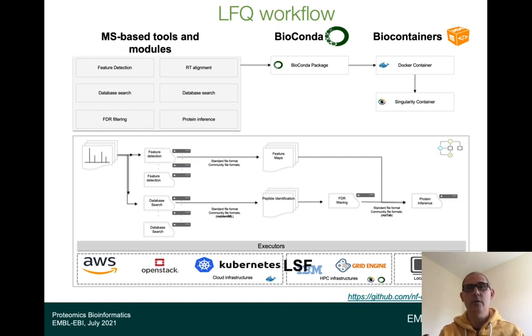Each small task goes into a tool, and this tool should go into a container, for example a Docker container. A Docker container is basically a self-isolated environment that can be run and deployed on a machine. And finally, this particular tool can be run on different machines, and then you get back the results and combine the results.